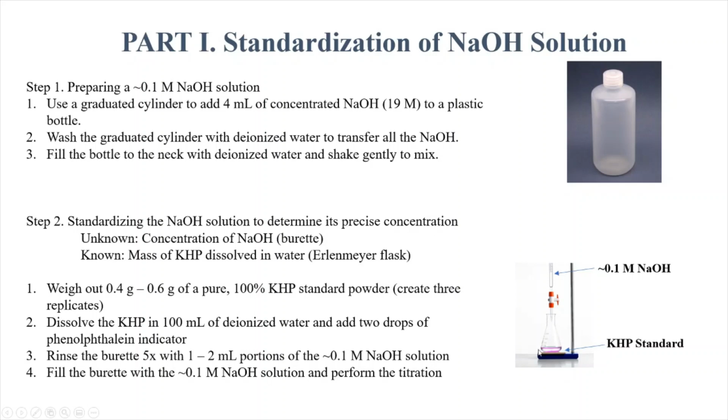So now we have our KHP standard and we have our sodium hydroxide. We're going to rinse the burette a few times with the sodium hydroxide solution, and then fill the burette with the 0.1 molar NaOH and perform the titration.